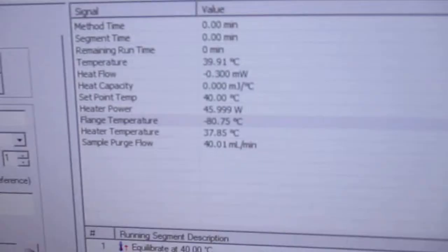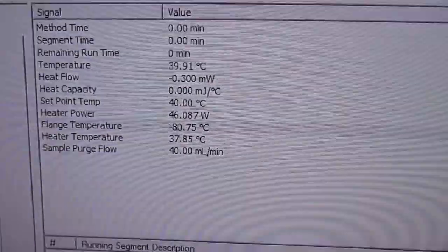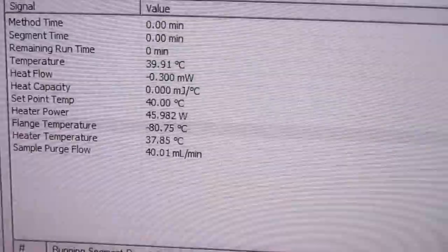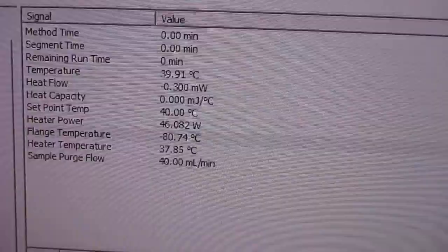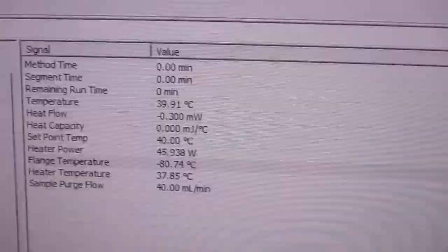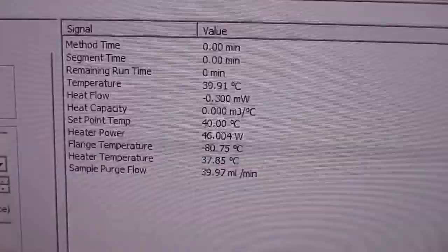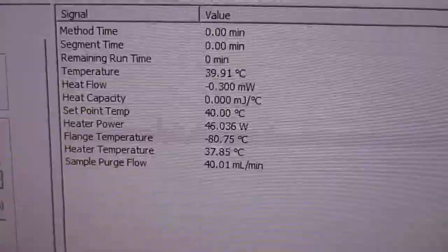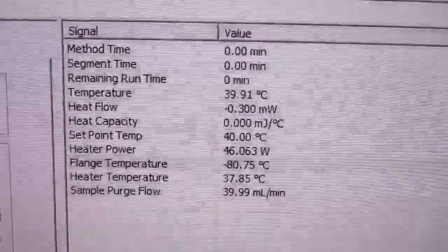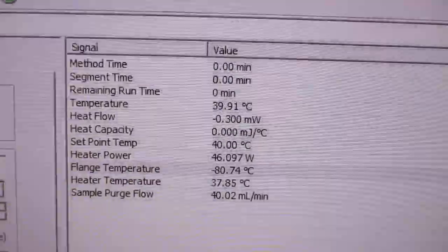That essentially is the temperature inside that stage platform, and you want it to be somewhere between -80 and -90 degrees Celsius, and that it is remaining very constant, so only fluctuating about 0.01 or 0.02 degrees. If it is not constant, it is not ready for the experiment yet. And if it is not that cold, again, it is not ready for the experiment. If it is too cold, so below -90, you might want to get it checked out before using it, but otherwise, if it's stable and within that range, it's good to go.